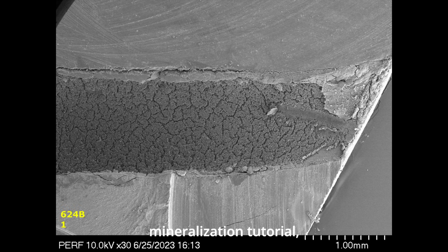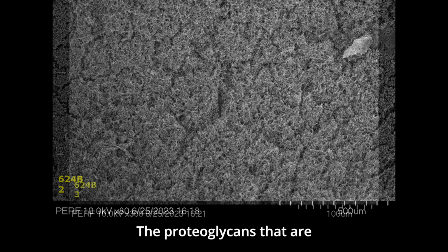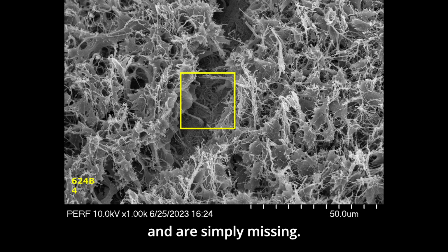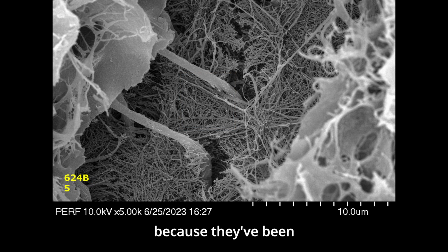If you followed the prior mineralization tutorial, you understand that there's a great deal of tissue here that's been lost. The proteoglycans that are in the tubule have been lost from the fixation and dehydration procedures and are simply missing. They were there, but you cannot see them because they've been removed by the dehydration and fixation procedures.